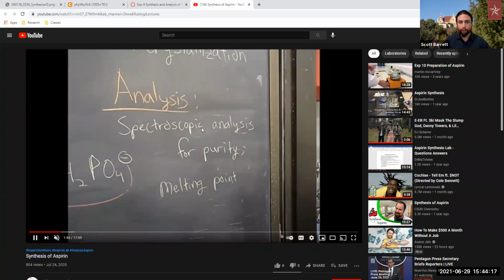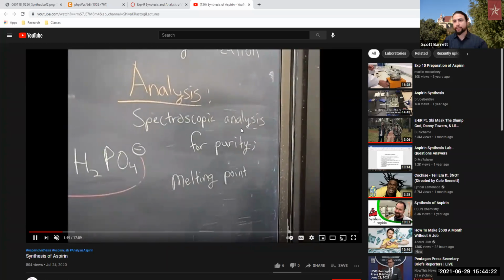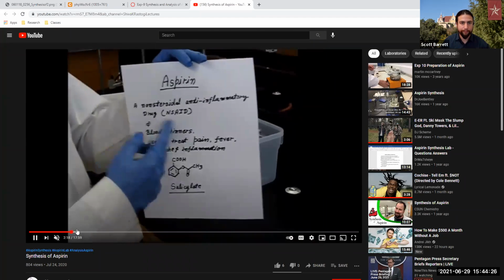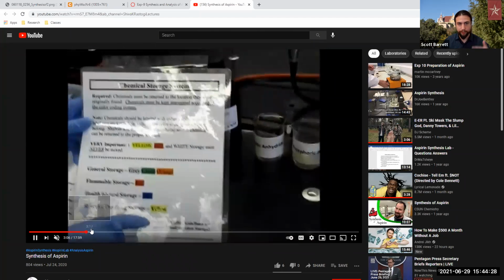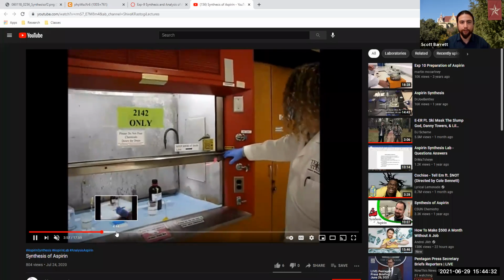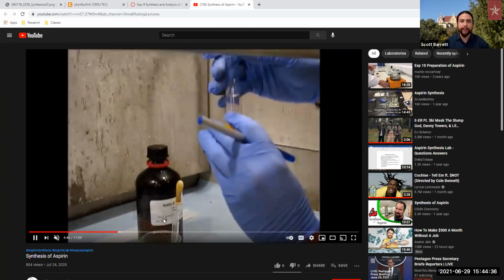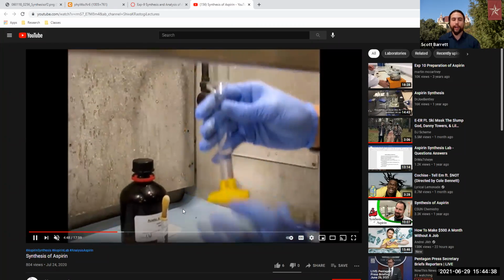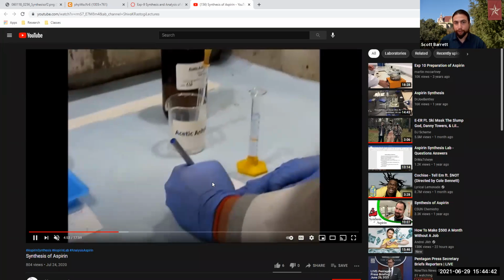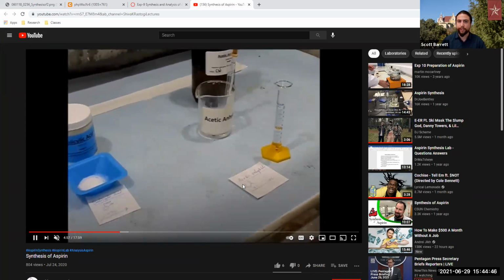And so then, of course, like we discussed in the lab manual, we're performing the spectrophotometry and then melting point analysis. And so, of course, here's some extraneous information that you'll want to review for the sake of your knowledge and learning synthesis. You would take your acetic anhydride, and as a liquid, you would want to actually measure it out and quantify it over. You can utilize the density in order to calculate your grams. But in this case, we're going to be using milliliters.